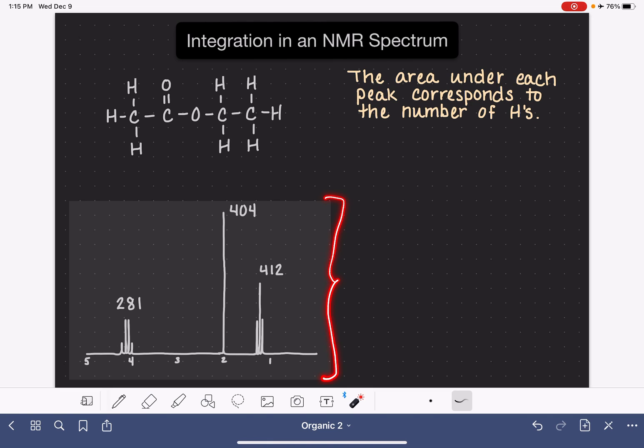This is an NMR spectrum that has the integral values written on it. The integral values are these large numbers that are oftentimes written adjacent to their respective peaks. Sometimes the integral values are written underneath peaks, sometimes they're just tabulated alongside the spectrum. We're going to analyze the integral values in this particular spectrum, but we're going to start with a simpler example.